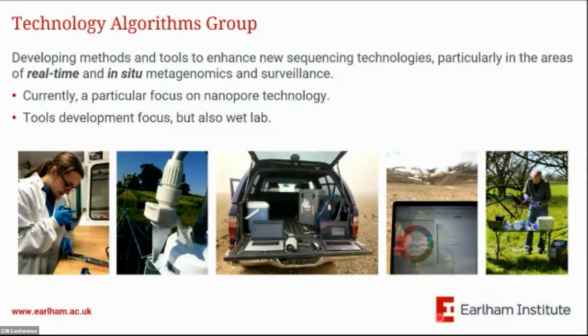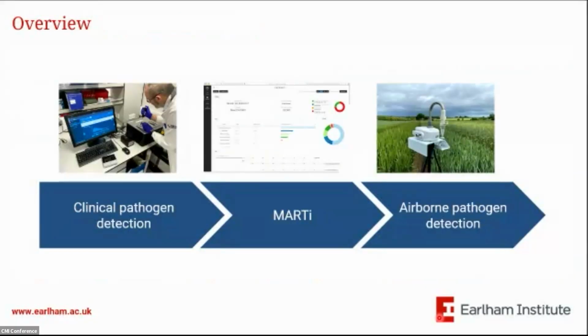Both of these things are only really enabled by nanopore technology, the only technology that can do this kind of real-time progressive analysis while sequencing continues, and really the only platform compact enough to take out of the lab. I'm from a computational background as well as the physics that Mark mentioned, but the group also has wet lab expertise, so we cover both sides.